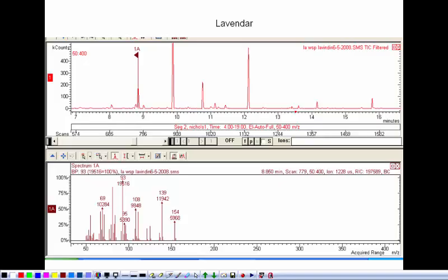So when I look at this mass spectrum, the first thing it tells me is this thing weighs 154 atomic mass units. And if I looked at the M+1 peak as a percentage of that, I could figure out how many carbons are in it. But without doing that, I can simply ask the computer to go ahead and match that mass spectrum against my library of a couple hundred thousand compounds and tell me what the mass spectrum most closely resembles.